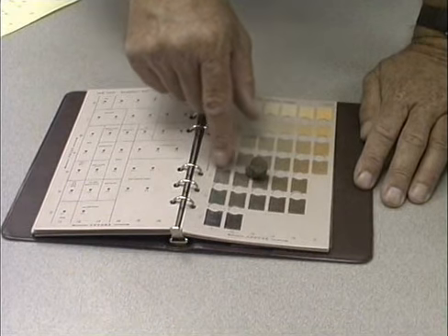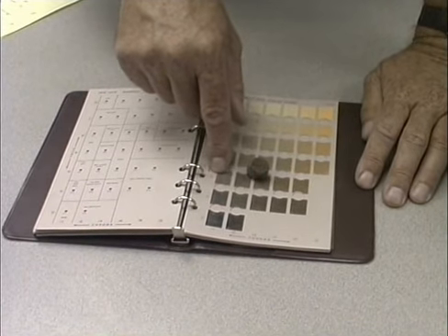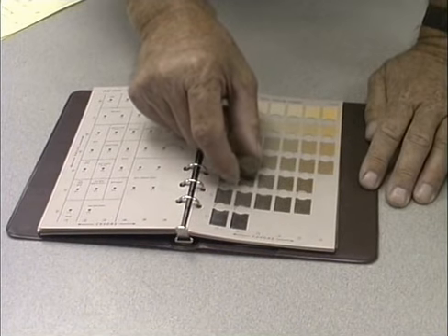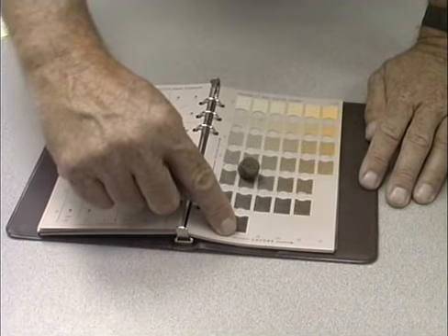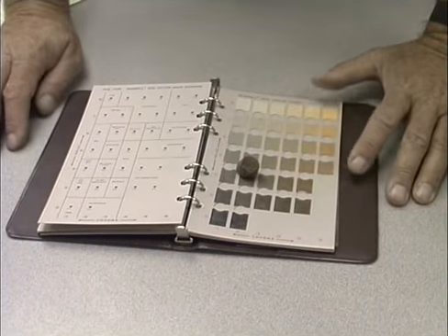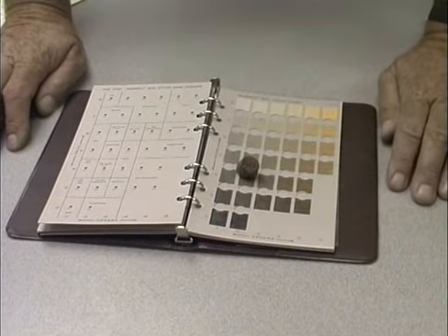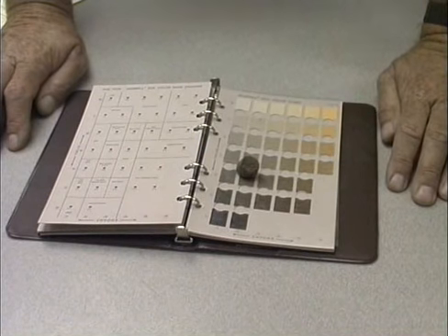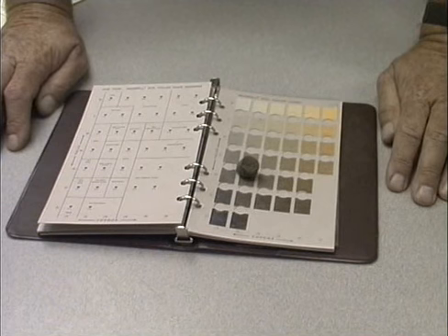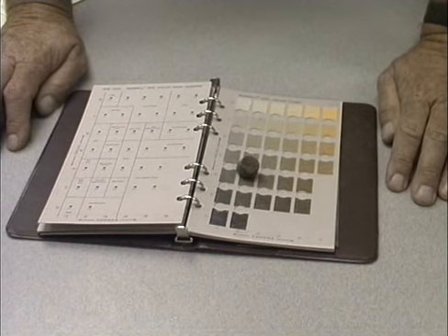As I look across, I believe it's in this value range of 4. And I believe it matches up best, chroma-wise, with this column of 2. So for this particular ped, we will call this soil a 10YR 4/2. 10YR is the hue, 4 is the value, and 2 is the chroma.